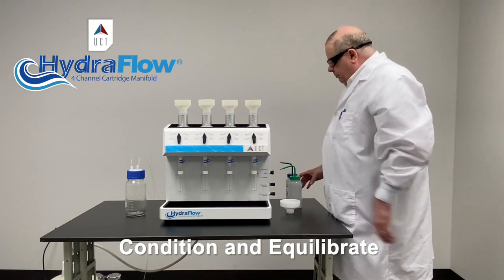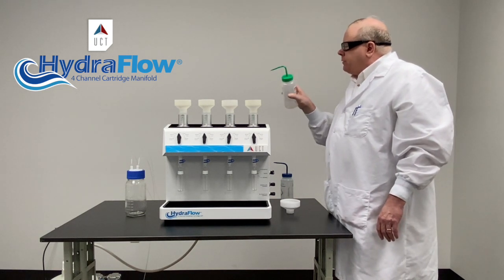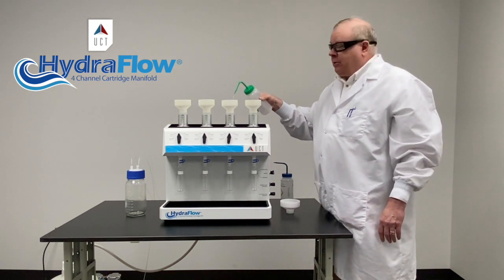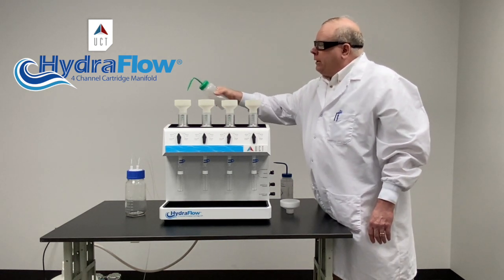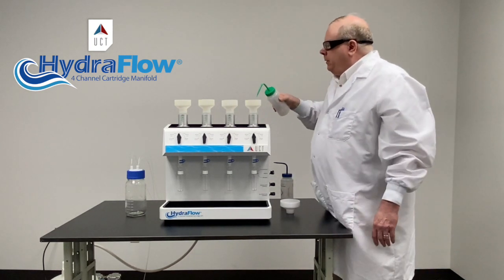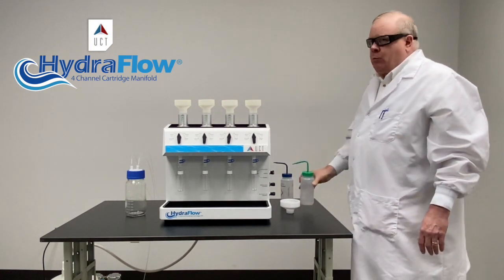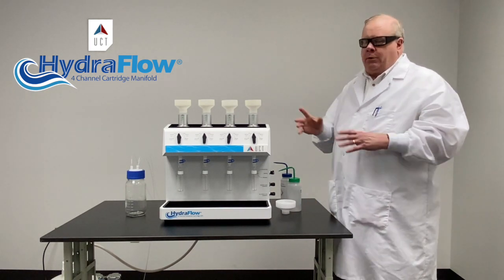We have our cartridges already in place. We add our conditioning solvent — in this case methanol. Carefully measure the right amount that it says in your method. It's really critical that you measure and get the correct amount of methanol. You want to cover the top frit. What this does is it allows the water to flow through the C18 more easily — otherwise it would be repelled and it wouldn't go through the pores. That's all the methanol does.